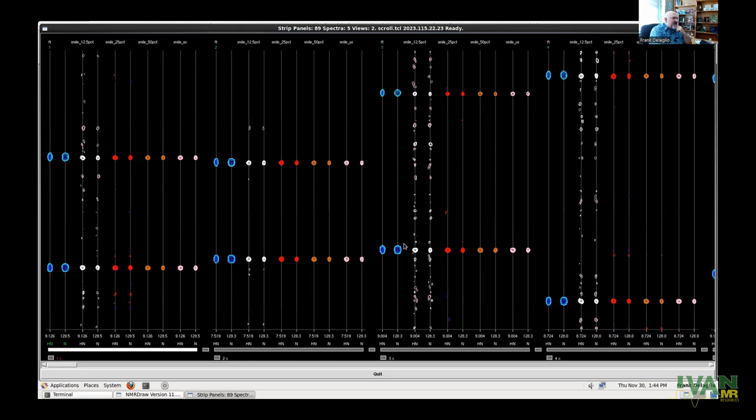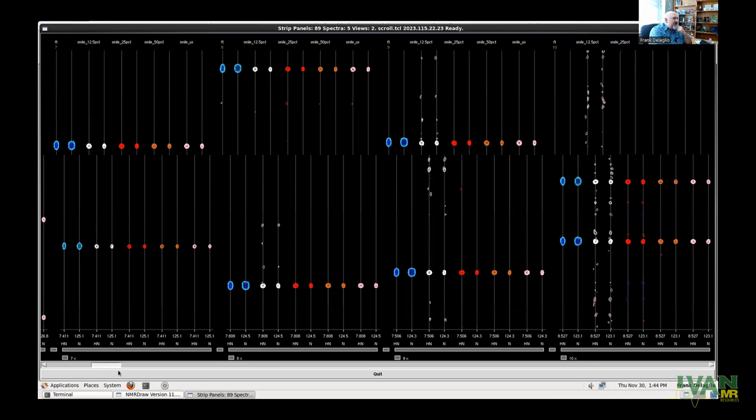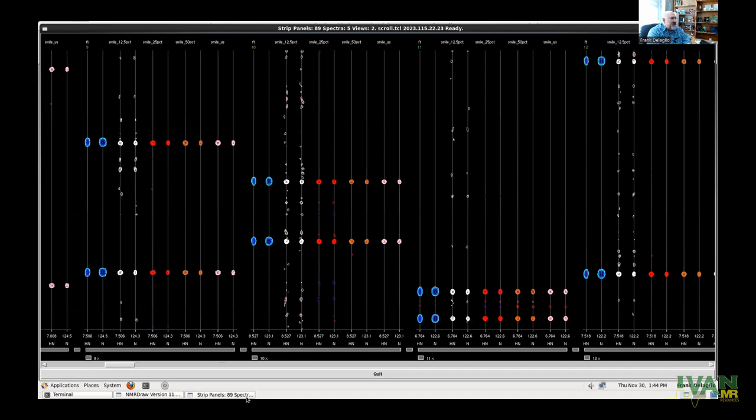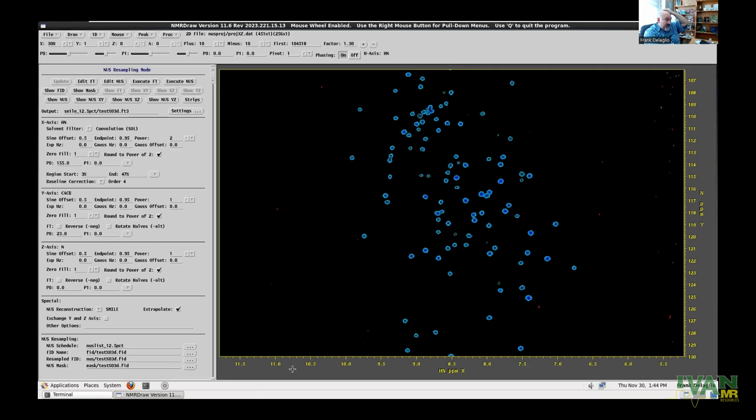So with a tool like this, you can figure out that for data of this complexity and signal to noise, 50% sampling is okay. 25% sampling is probably okay, but less than that isn't. So this helps you make a decision like this and decide whether or not in future you should run this particular experiment with non-uniformly sampled measurement or not.